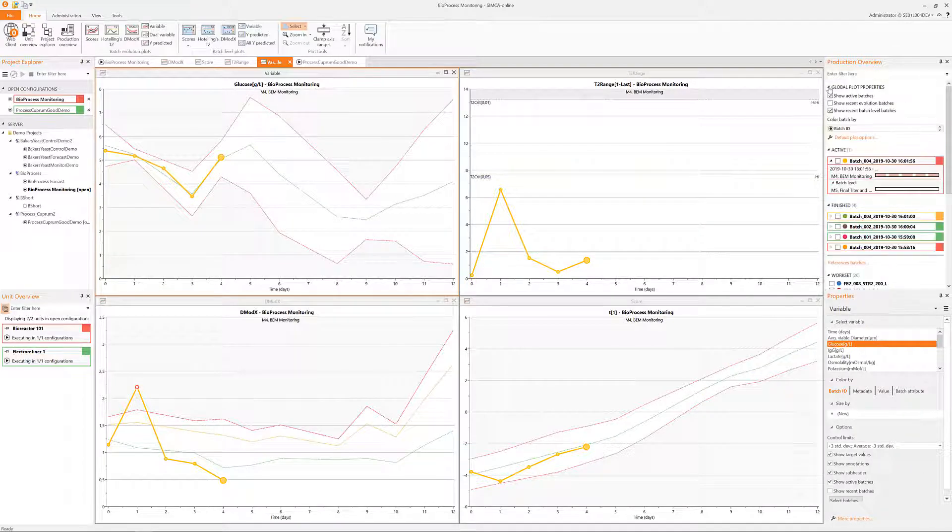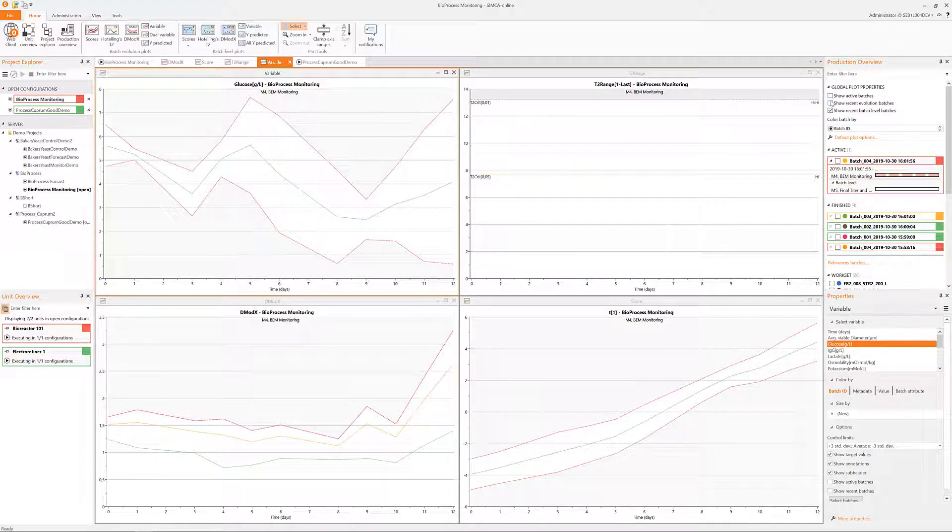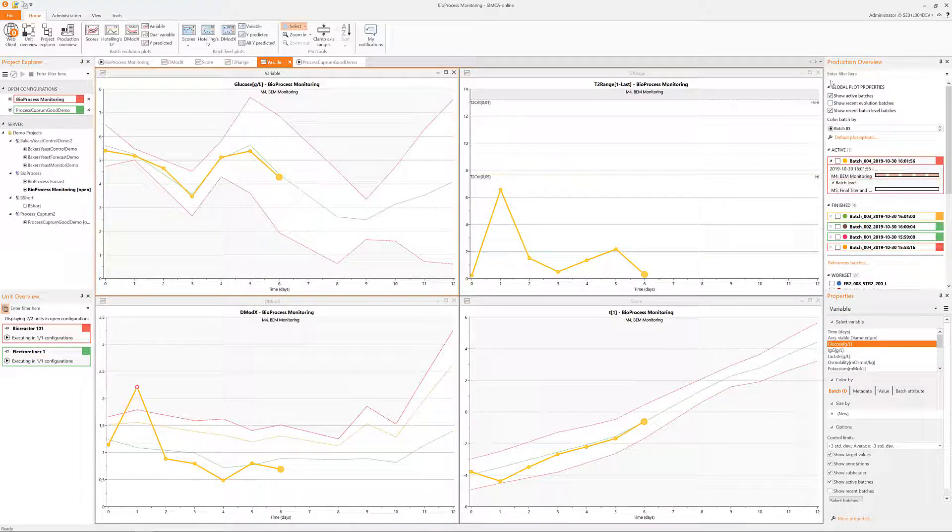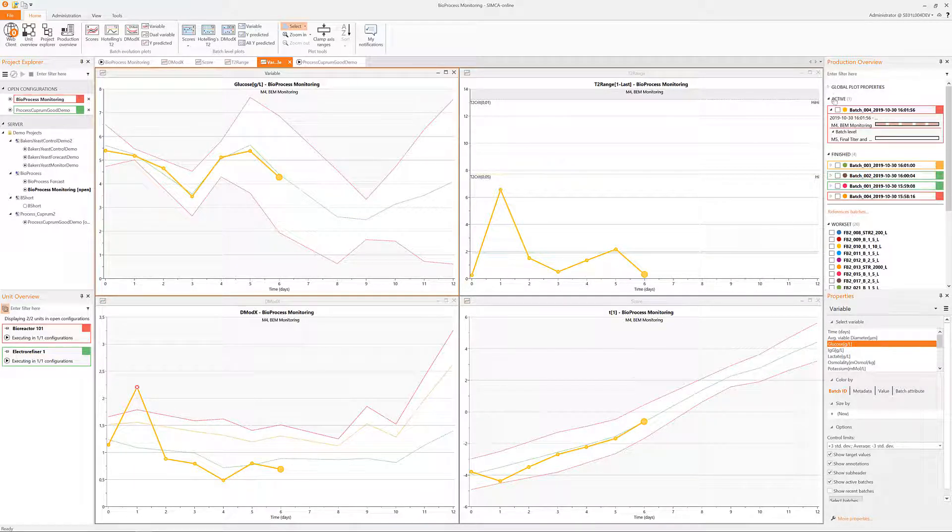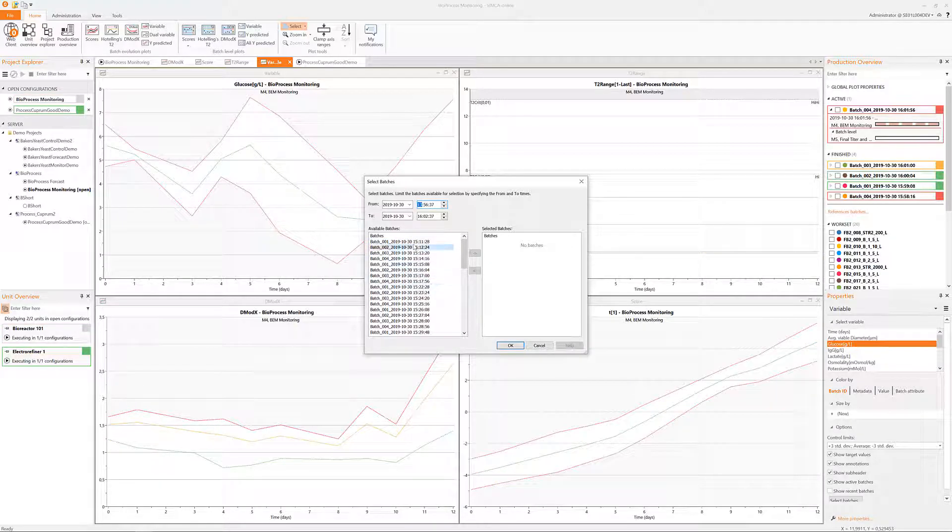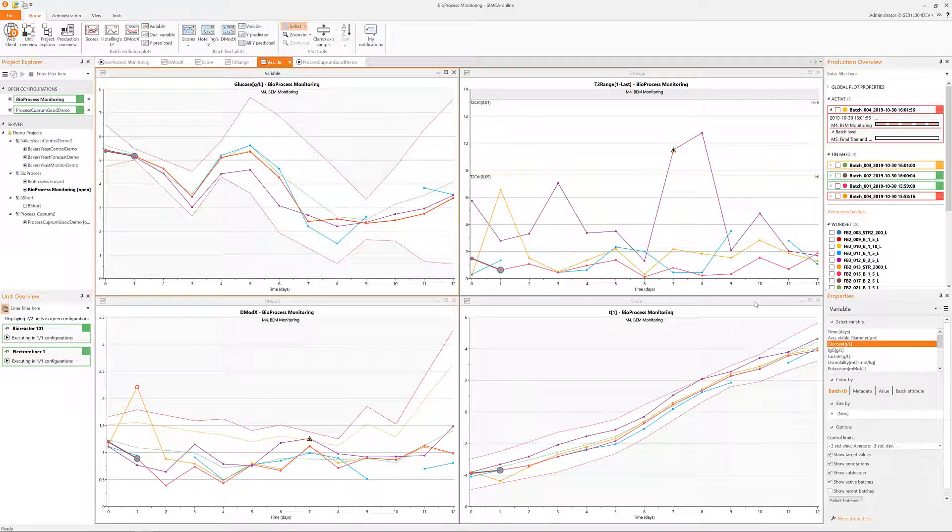It is also possible to apply category coloring to all of the charts at once, and historical batches can be searched for and used as future reference.